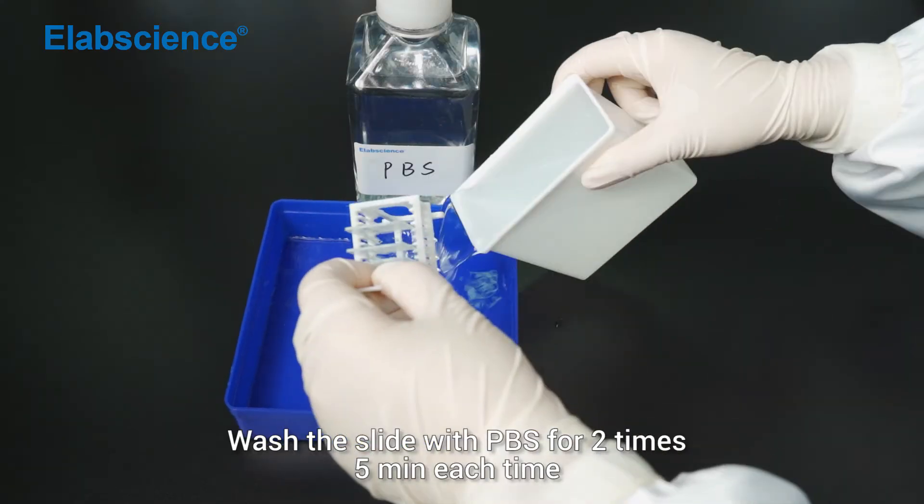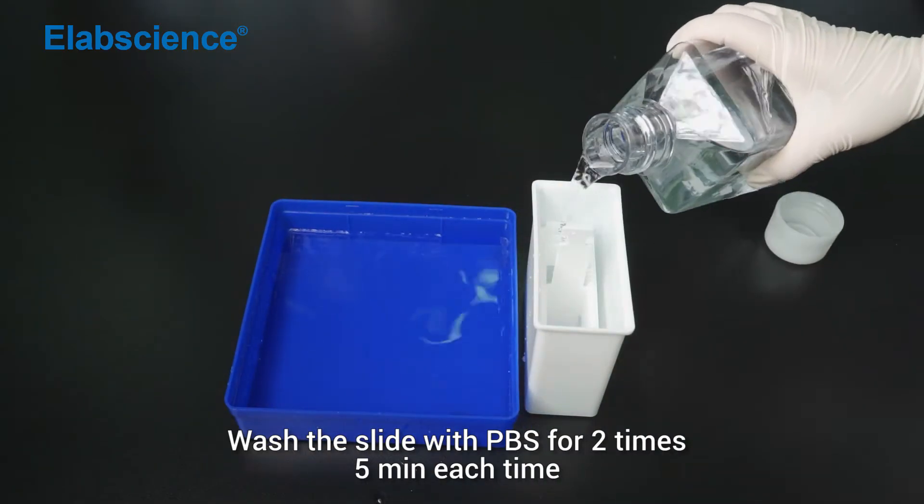Wash the slides with PBS for 2 times, 5 minutes each time.